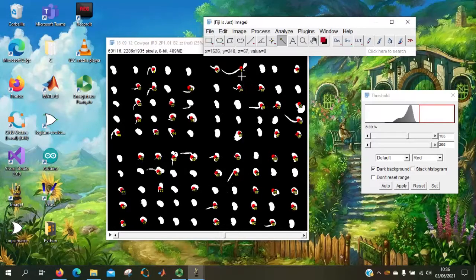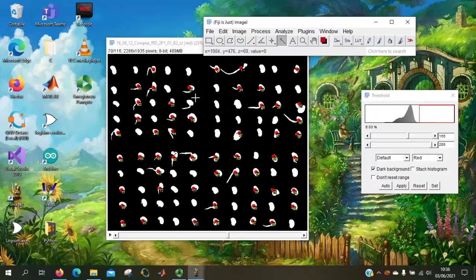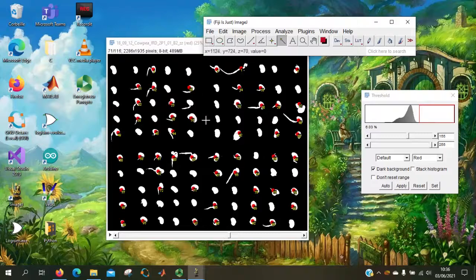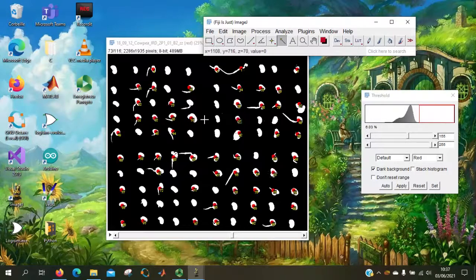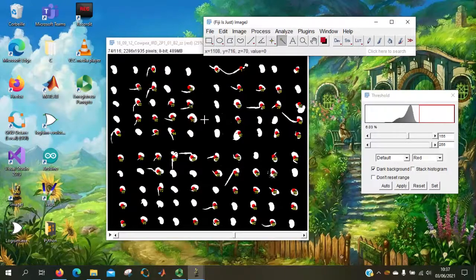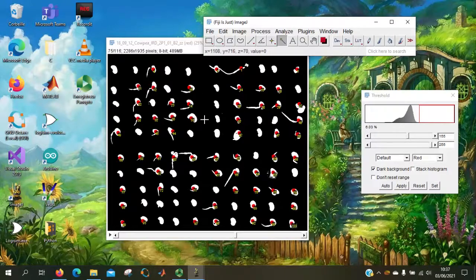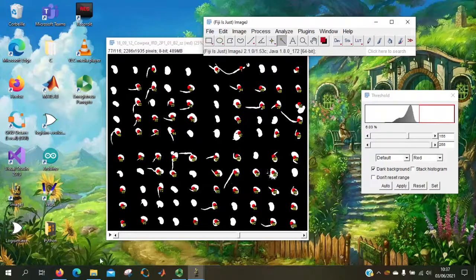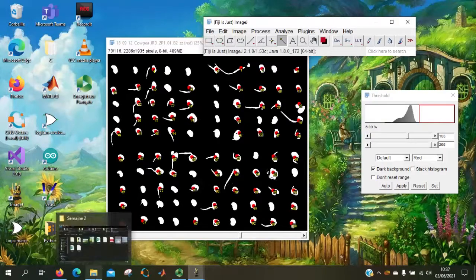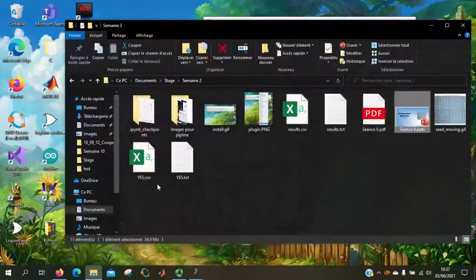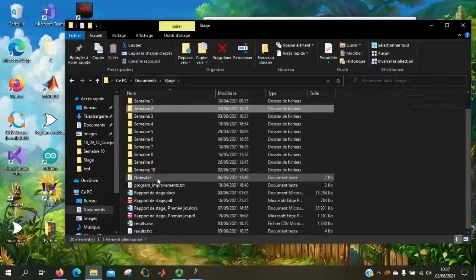So here it is the 1, the 5, 15. So it corresponds to a file which is given at the end of this program.